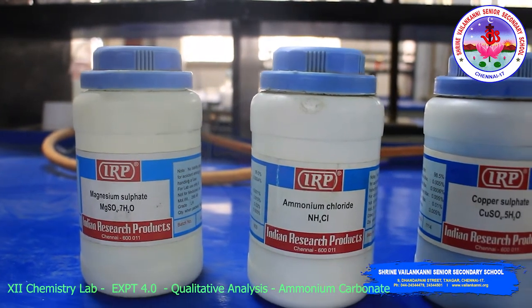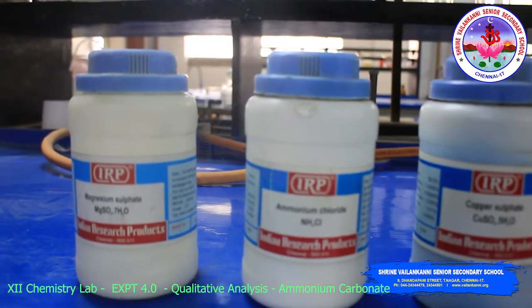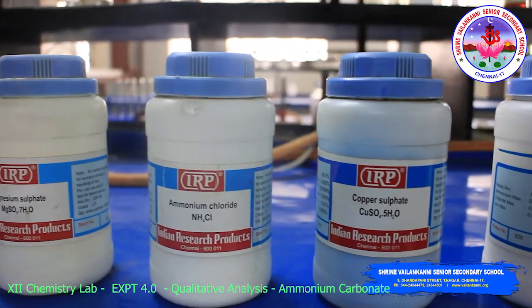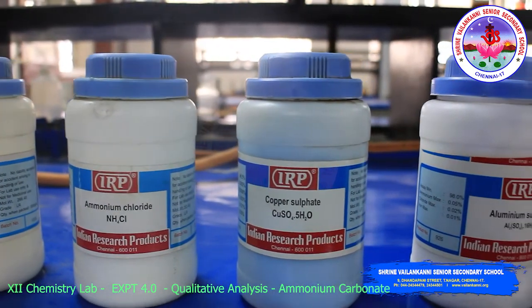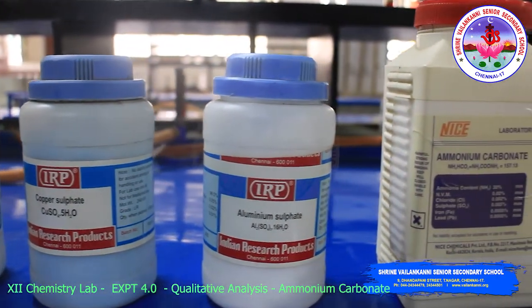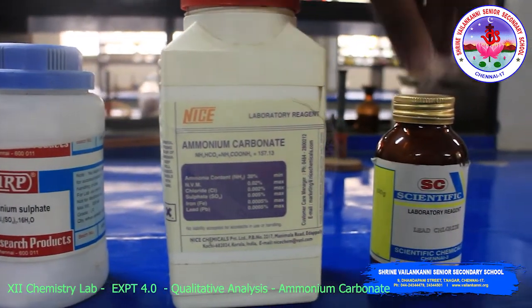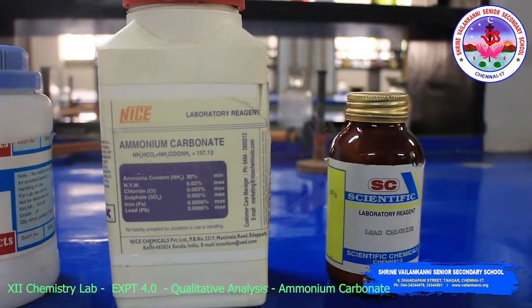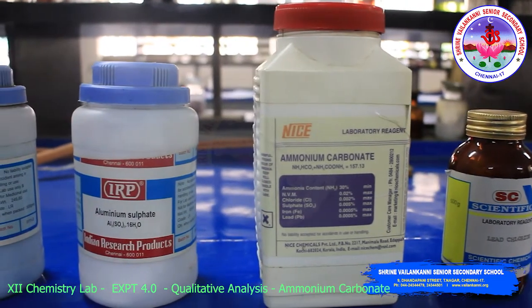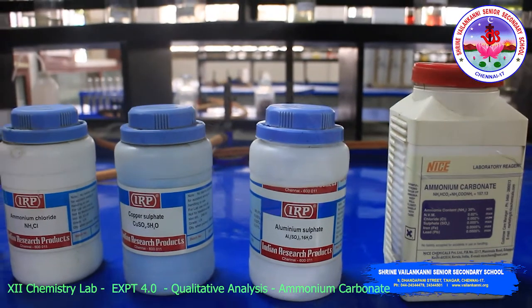This year we are going to do these salts: magnesium sulfate, ammonium chloride, copper sulfate, aluminum sulfate, ammonium carbonate and lead chloride. These 6 salts we will do the confirmation tests for here, but you have to do the systematic procedure. I will show you the confirmation tests for these substances.